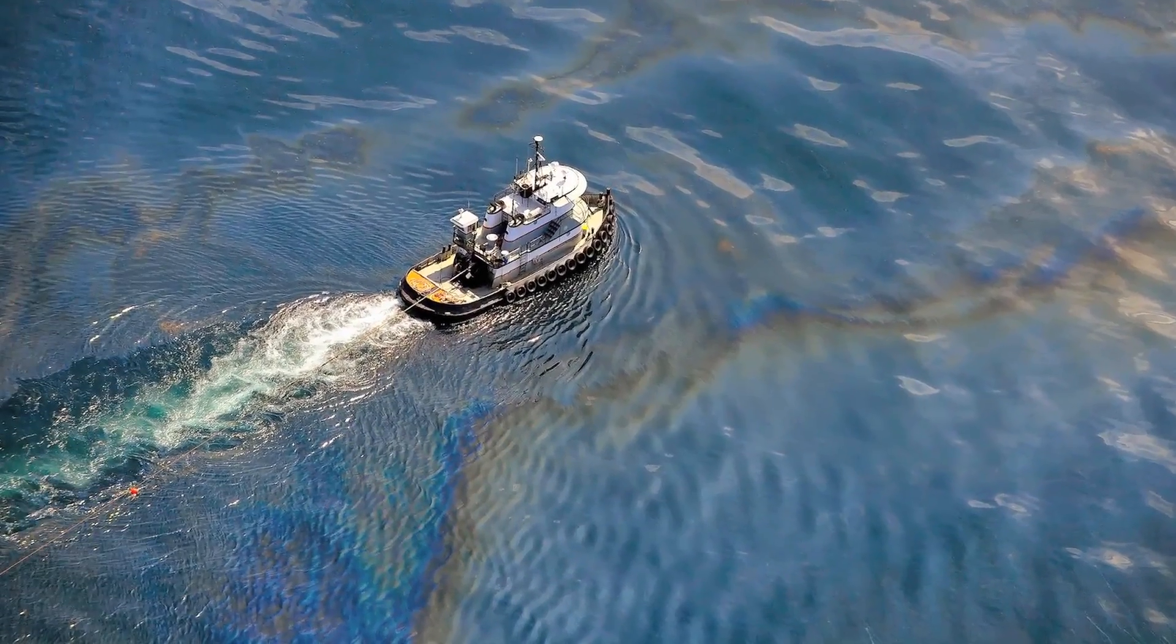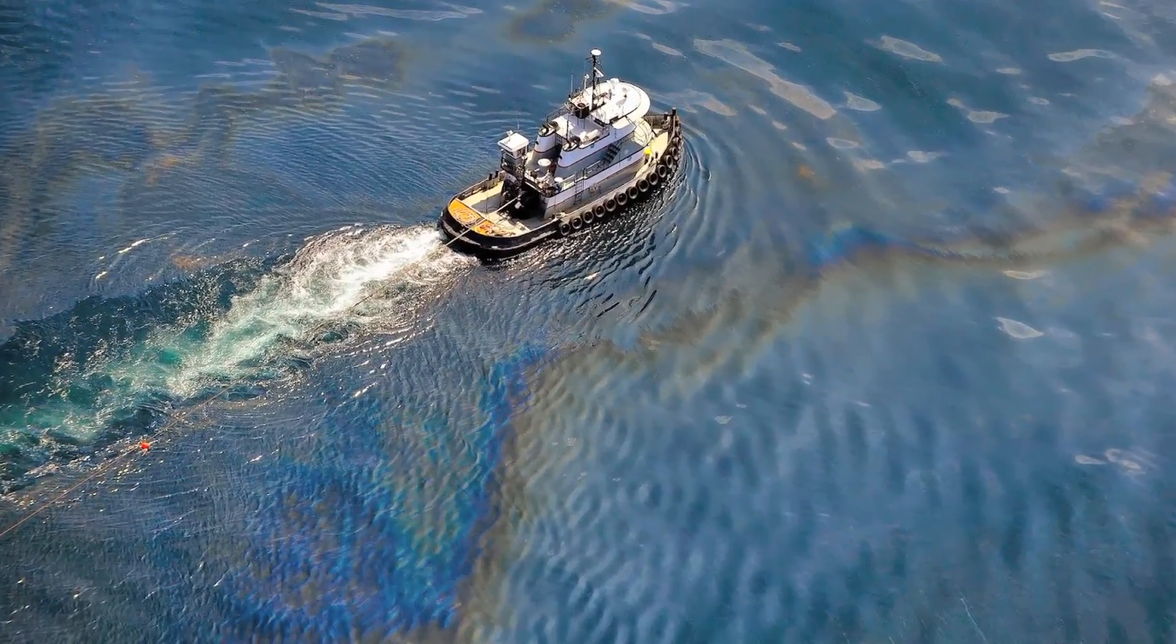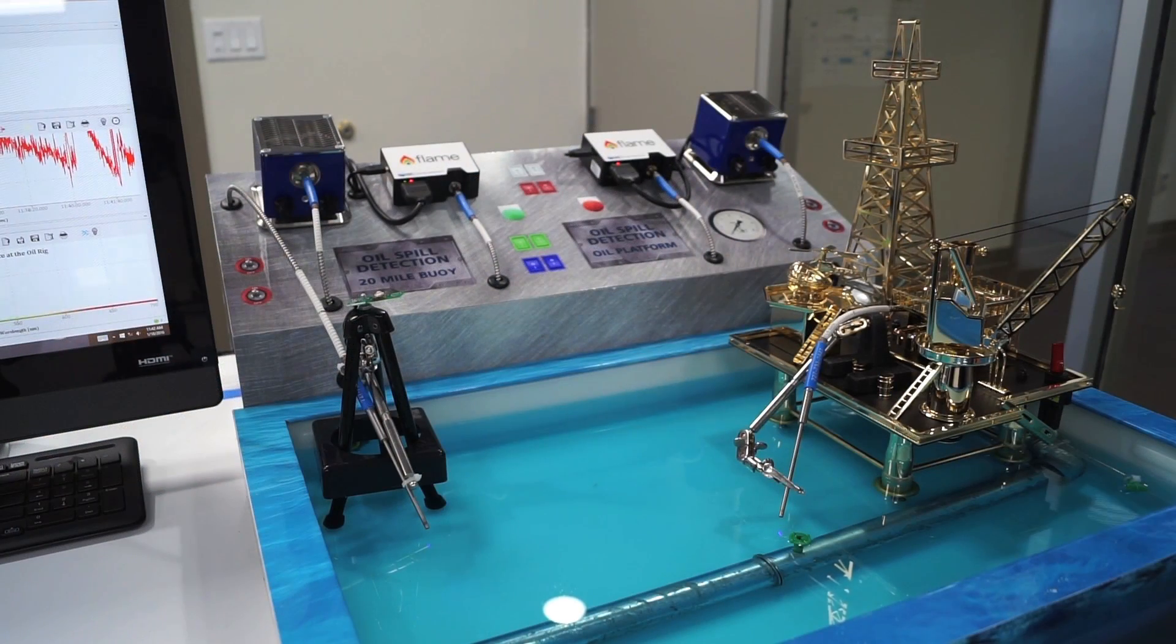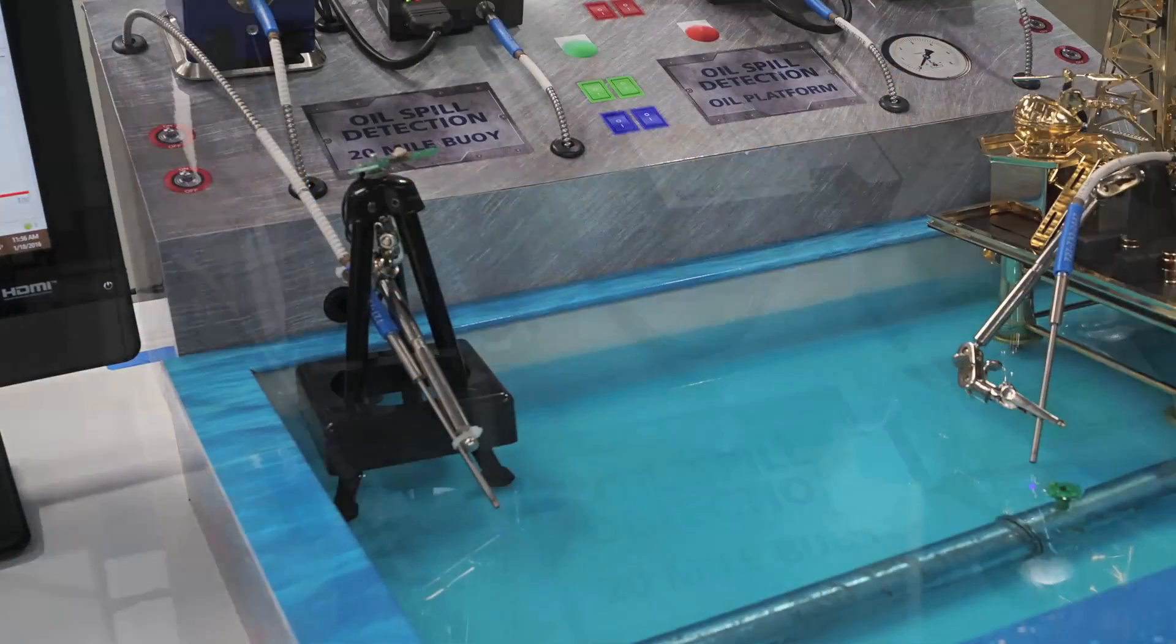One very important environmental monitoring application is the detection of oil and water. What we're showing here is the use of modular spectroscopy to continuously monitor the ocean both at an oil rig and also at a buoy 20 miles away.